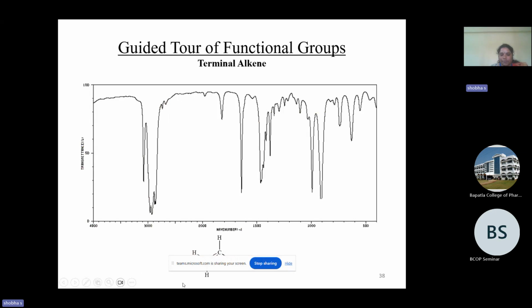Another example is here. Please look into this. It has a double bond as well as an aliphatic chain. So if anybody is really following, they are in a position to tell me. It's quite difficult for me also to interact with you people. By seeing the structure, we come to know it has an aliphatic alkane structure as well as C double bond C. By analyzing systematically from zone 1, see here one by one.